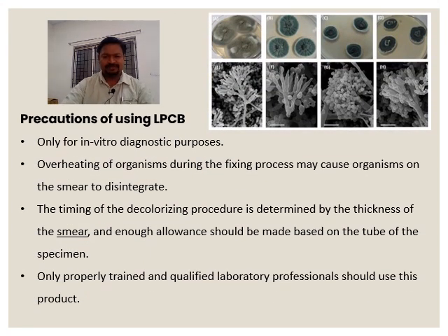Precautions for use of lactophenol cotton blue: it is only for in vitro diagnostic purposes. Overheating of the organism during the fixing process may cause the organisms to disintegrate. The timing of the decolorization procedure is determined by the thickness of the smears, and enough allowance should be made for the tube of specimen. Only properly trained and qualified lab professionals should use the products.